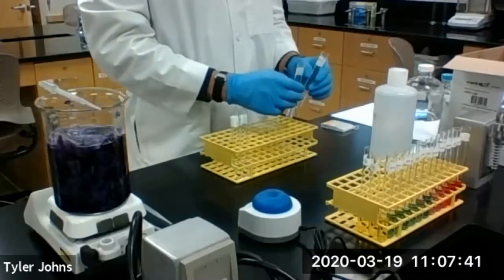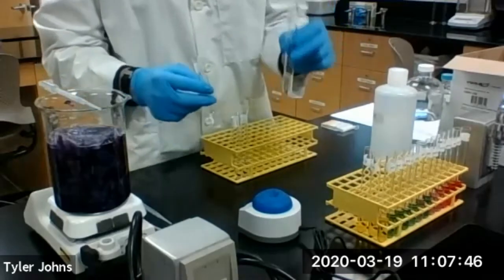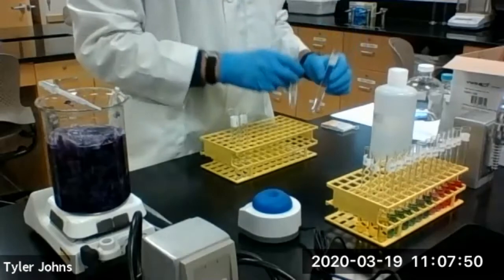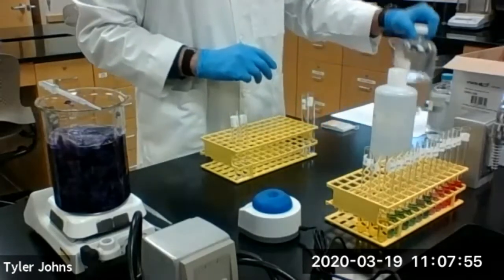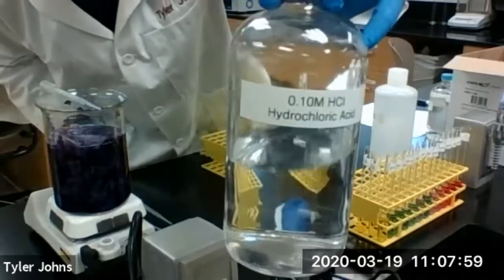So with our first set of test tubes, we have one test tube that has 5 milliliters of deionized water, and we have another test tube that has 5 milliliters of pH 7 buffer. To these 2 test tubes, we're going to be adding 5 drops of 0.1 molar hydrochloric acid.